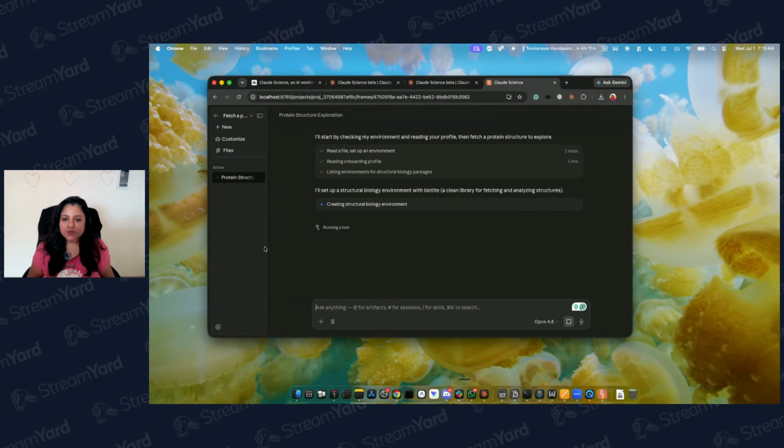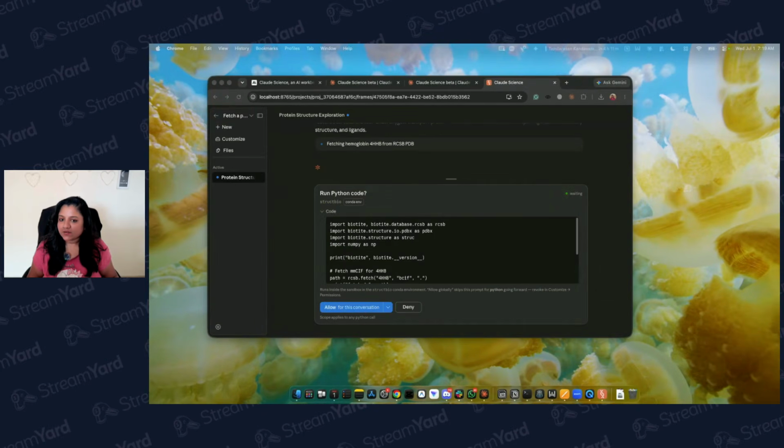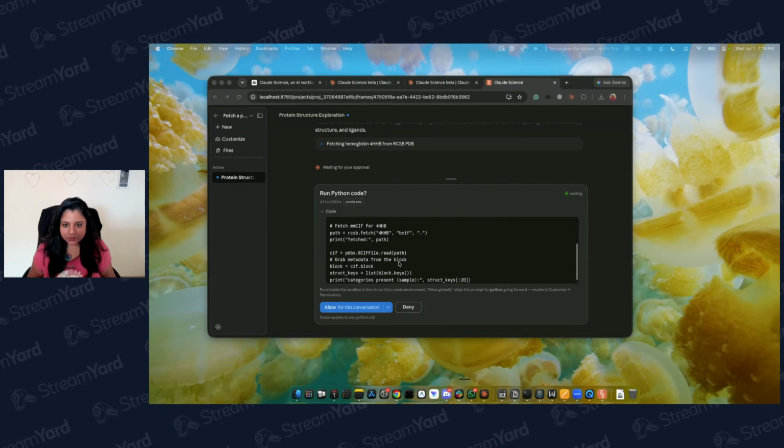But in any case, because I'm approaching my weekly usage limit, I'm going to go on to Claude and enable extra usage so that this session does not get interrupted. Let me do that while this is running. Okay, so it wrote me a bunch of code.